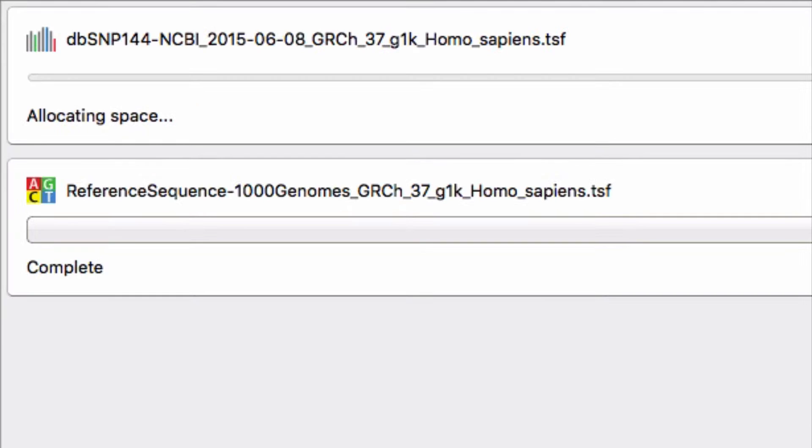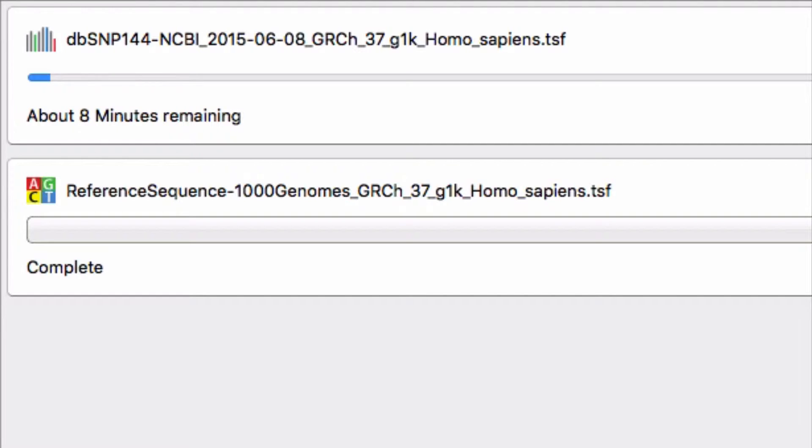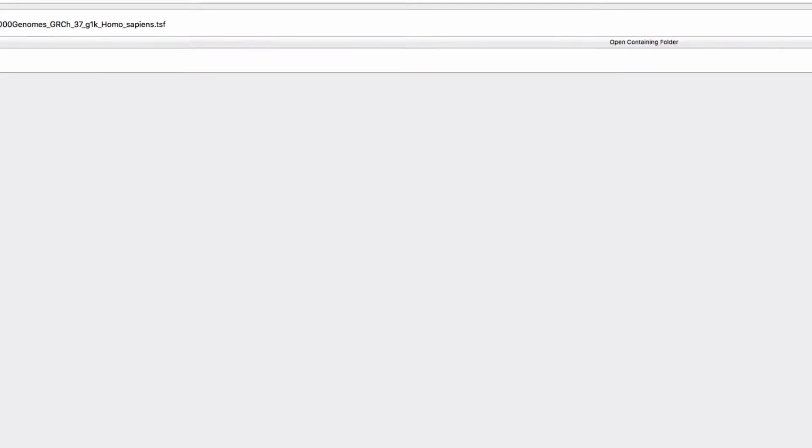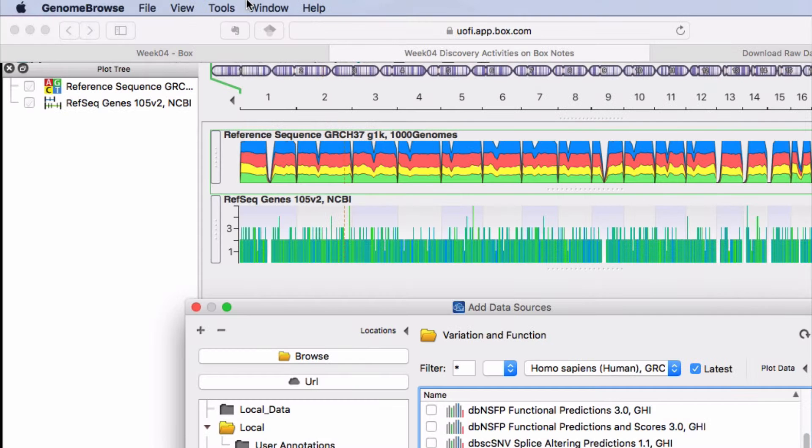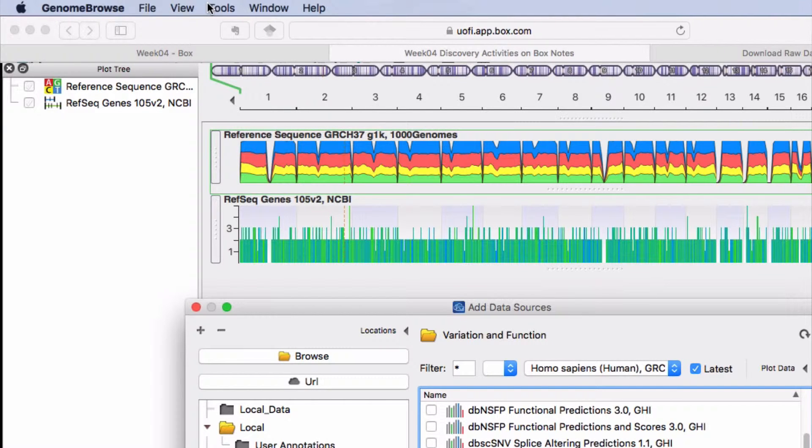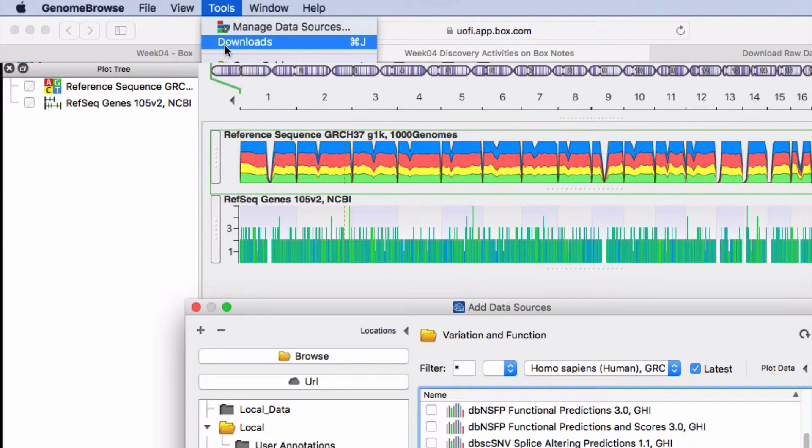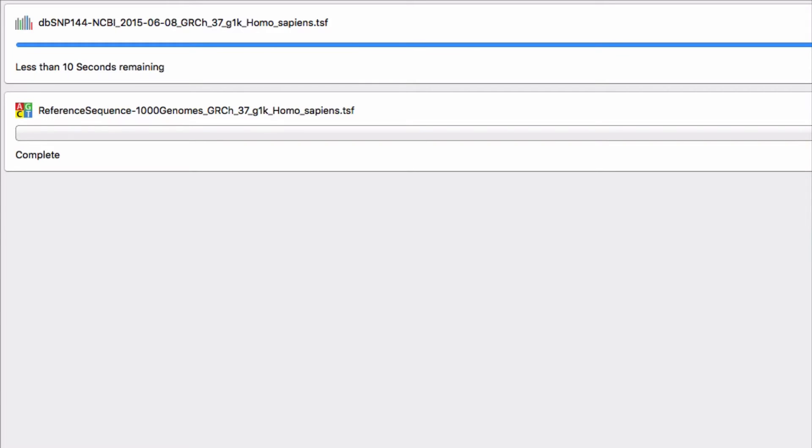After you click the download button a download window appears. The time it takes to download this big file depends on your internet speed. If you move away from the download window, it is easy to bring it up again using the tools menu in Genome Browse.